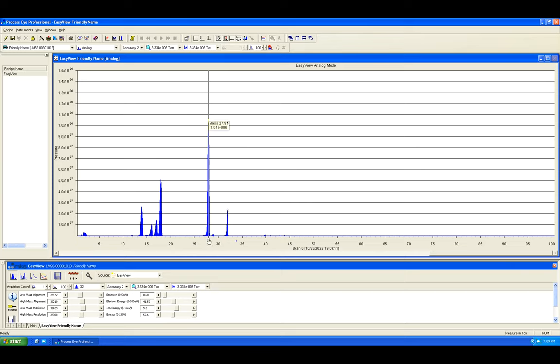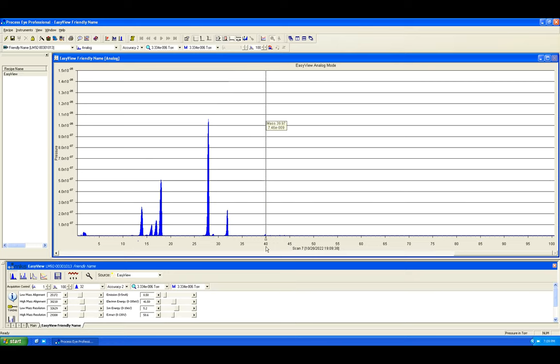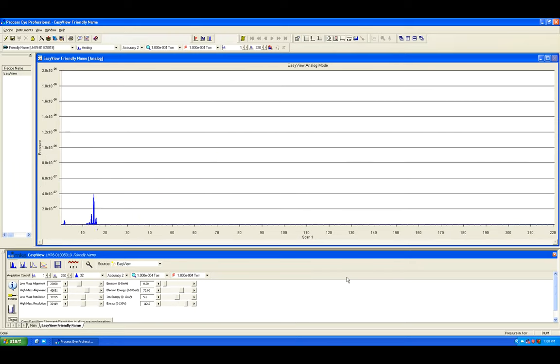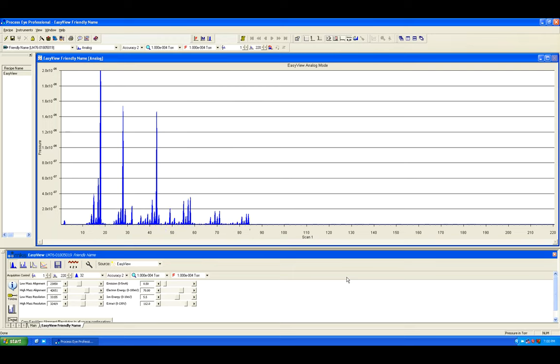Mass 28 is the dinitrogen. Mass 32 is the dioxygen. Mass 40 is the 1% argon. Mass 44 is the carbon dioxide, making up over 400 ppm in the air and still rising.